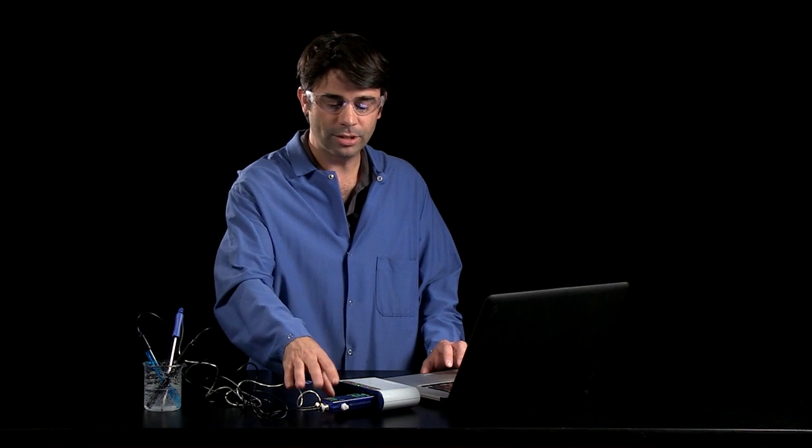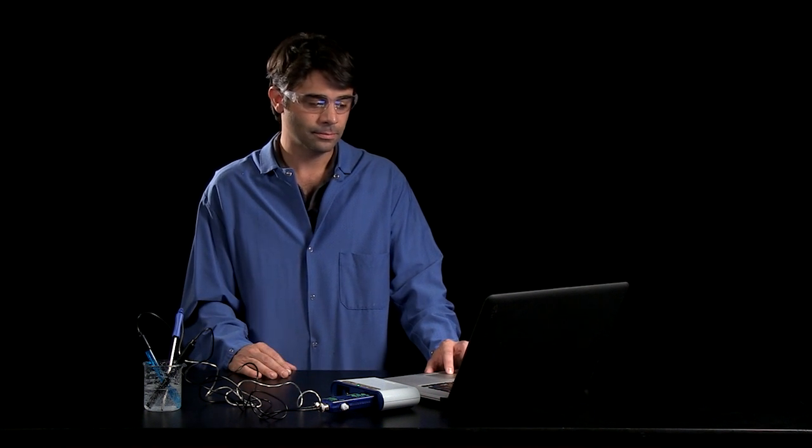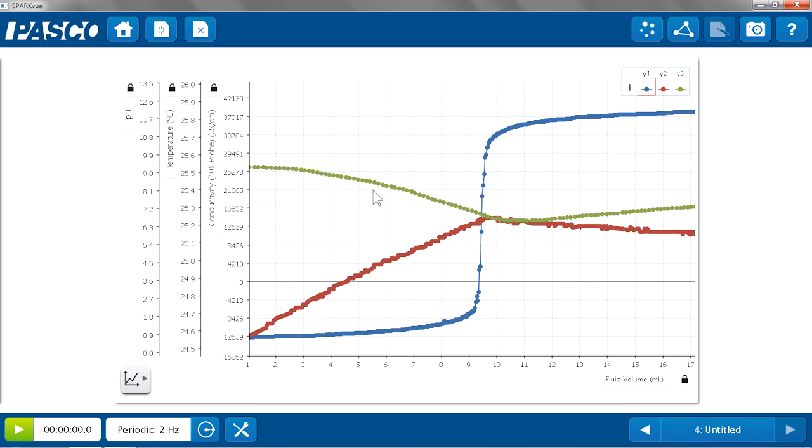And again, because of the multi-measure nature of this, I can look at all those things simultaneously. And this is really where the big ideas can come together. Here's my graph of pH, my Y1. Temperature, my Y2, the red one. And conductivity, the Y3. And I can see they all meet up at the same point where the equivalence point was reached, and that's where the inflection points for those graphs were.